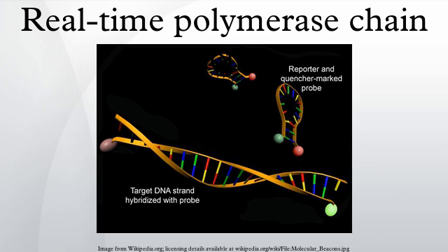The most commonly used normalizing genes are those that code for the following molecules: tubulin, glyceraldehyde 3-phosphate dehydrogenase, albumin, cyclophilin, and ribosomal RNAs. Basic principles.